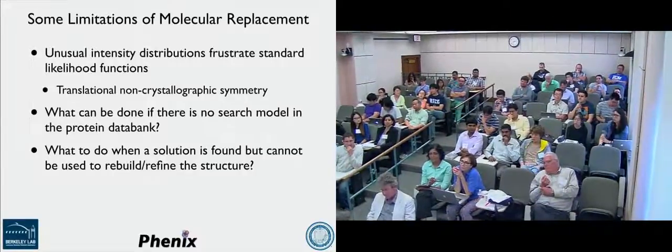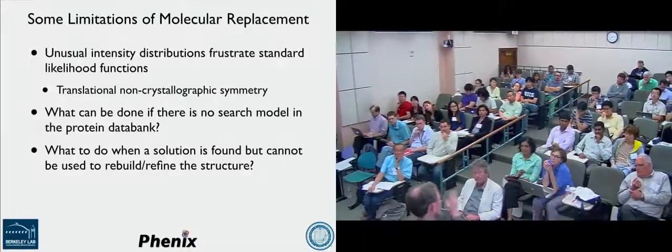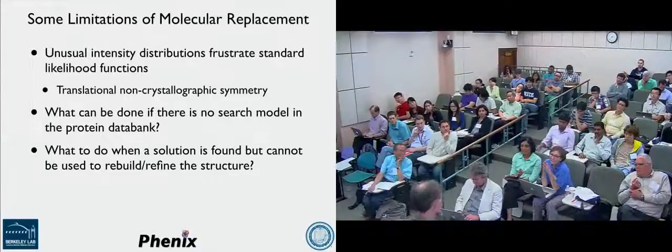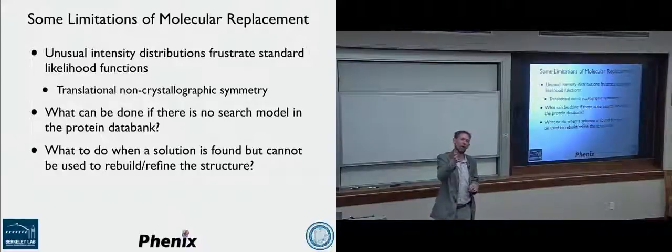Well, what I'm going to show you in terms of Rosetta, very briefly, sort of gets to that. You can run all sorts of things to try and get models, so in a sense Rosetta tries to do that in one way.